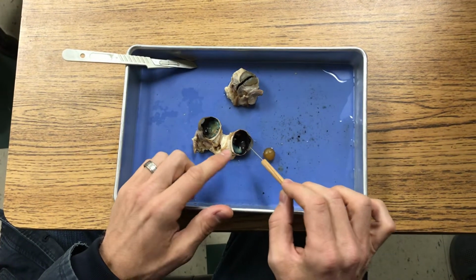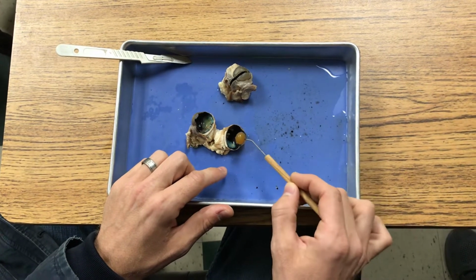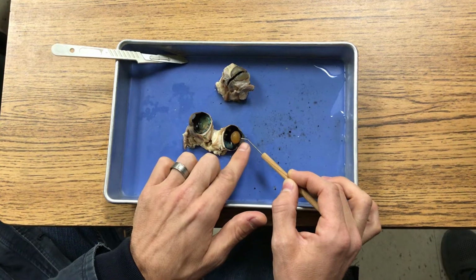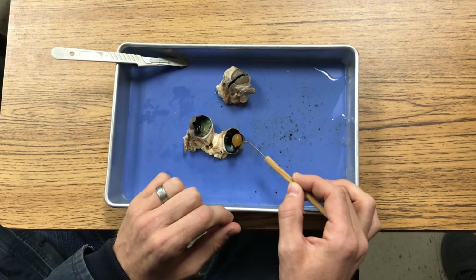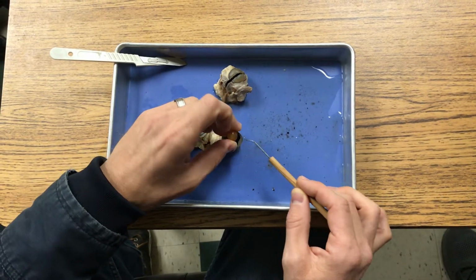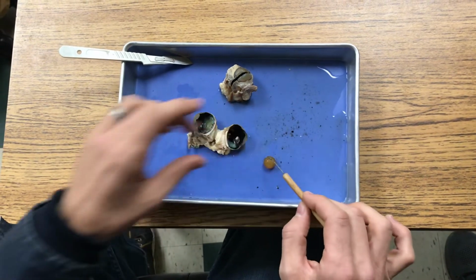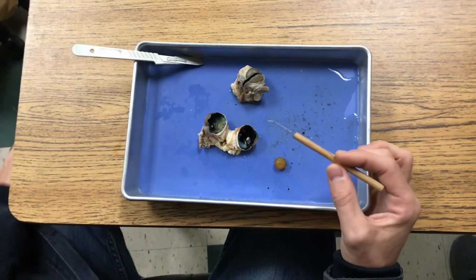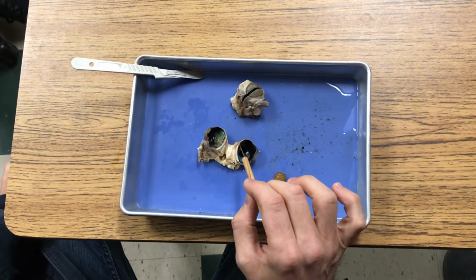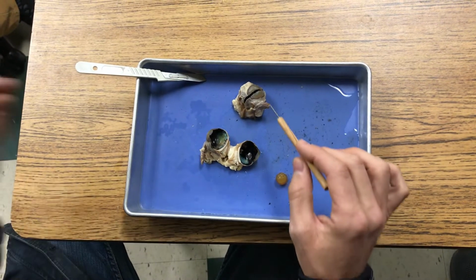from the cornea to the lens, and this is the lens here. And the lens would fit right in there. That would be the anterior chamber. And then kind of around the lens is the posterior chamber. And both of those are filled with a fluid called aqueous humor. And then you have the larger chamber, the vitreous chamber, and it is filled with vitreous humor.